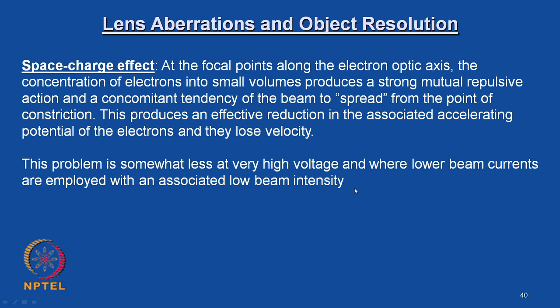So this particular effect especially belongs to this electron optical system. And you have to remember, the aberrations which we talk about and their effect on resolution, we simply assume that, or we simply do not consider the specimen condition.